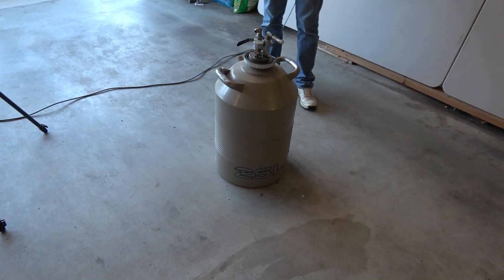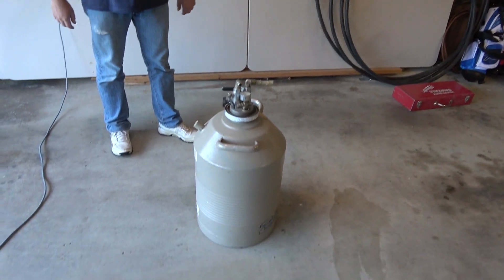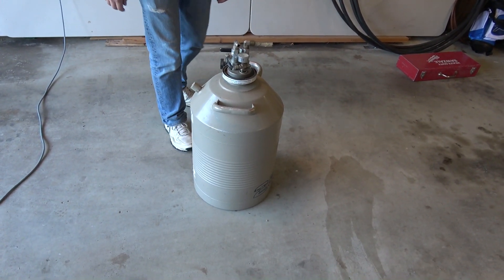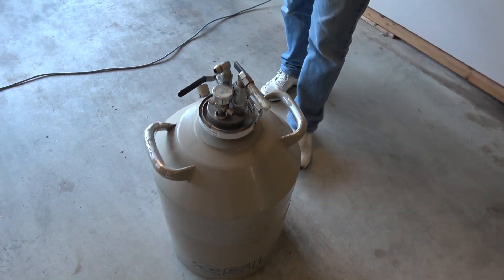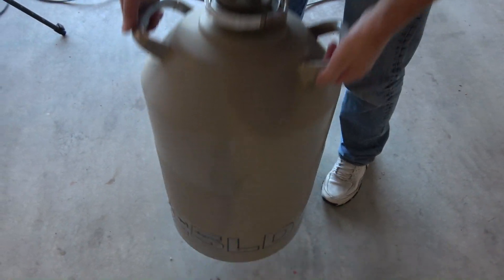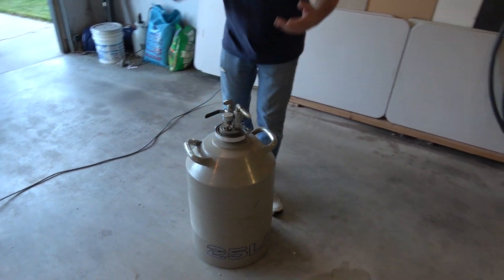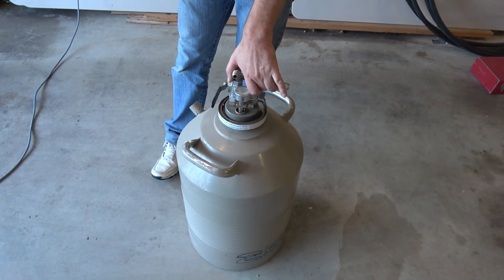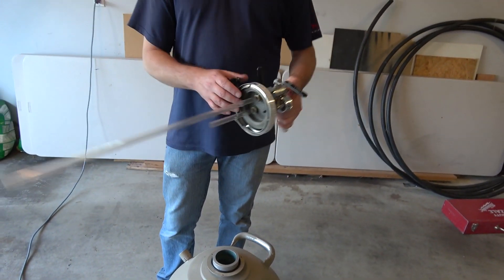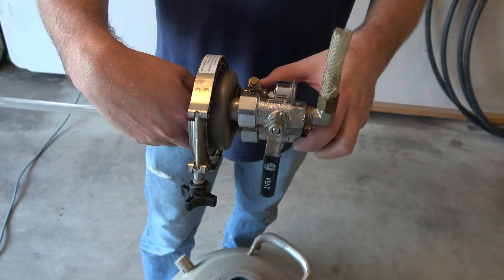Well, we're in the lab, aka the garage. This is where we record the podcast. I have this dewar here — I've had this for many, many years, and it's broken. It leaks. For the folks at home, it's a dewar. This is kind of a cool-looking guy. This is an LD25, and it basically is what you put liquid nitrogen into. When I got it off eBay, it came with this withdrawal device, which I used once, and it's pretty darn awesome. It looks fancy — and it's actually really freaking expensive, too.